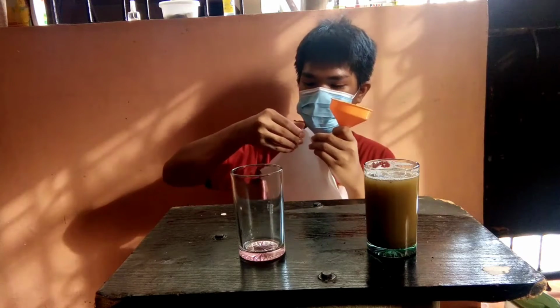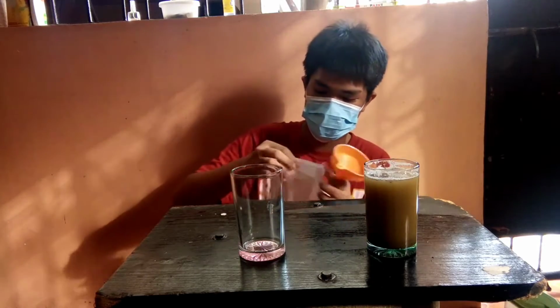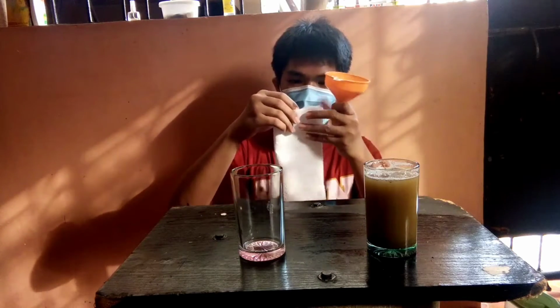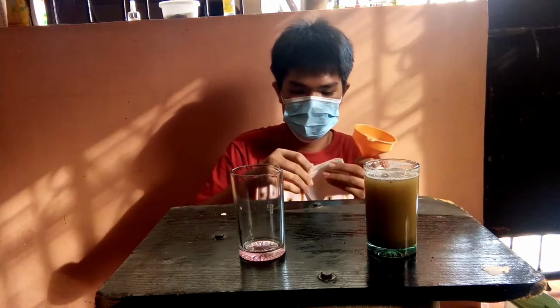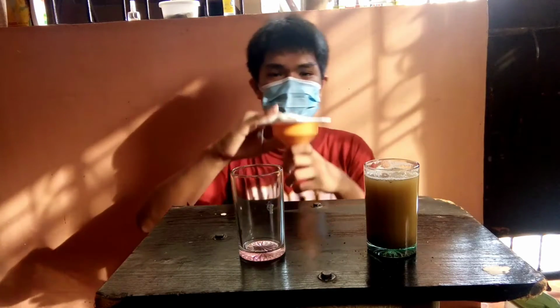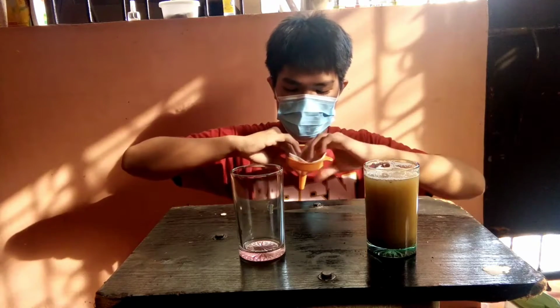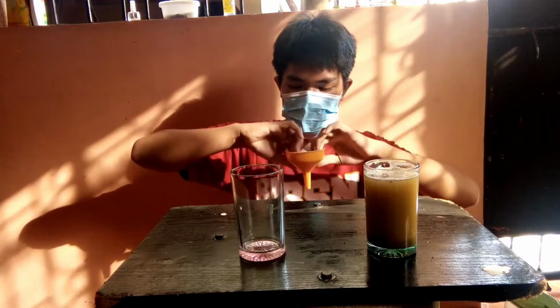Then we're going to align them. Now we're going to make it square so that it could fit in the funnel. There you go. That's what it's supposed to be. Now we're going to put it in the funnel. Make sure it covers everything. Otherwise, it will not filter properly.